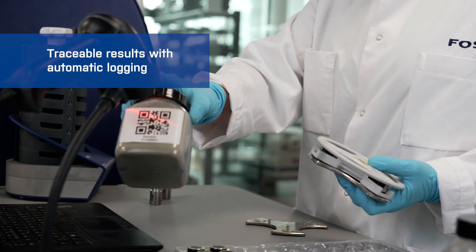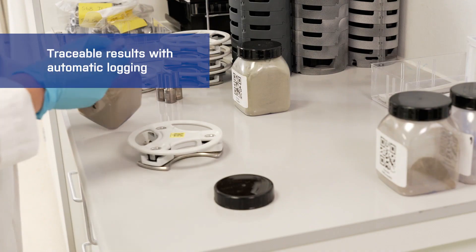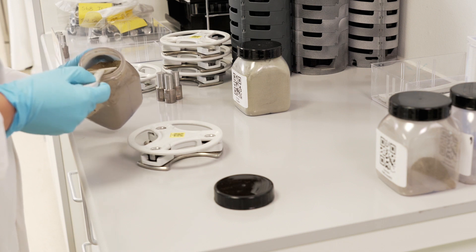ID barcodes are scanned and matched via cloud to ensure traceable results and avoid the risk of error.